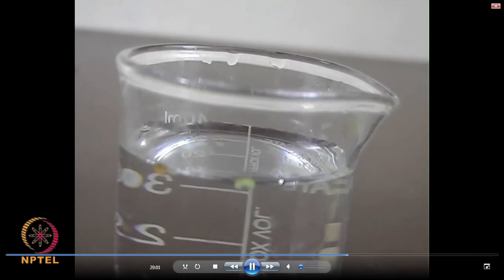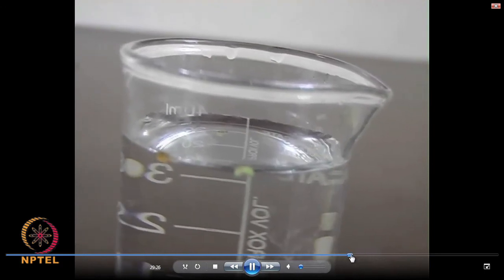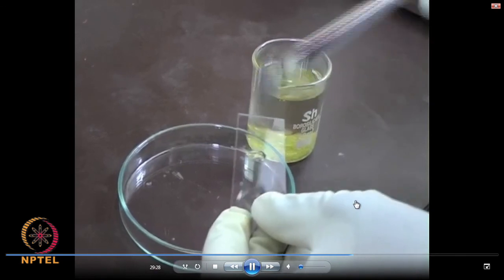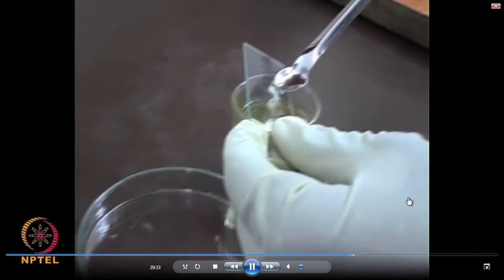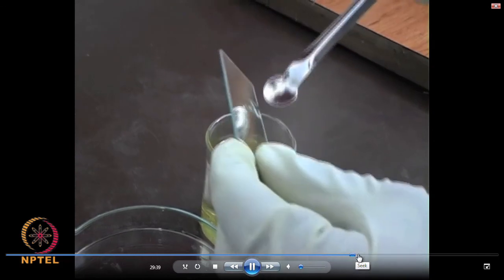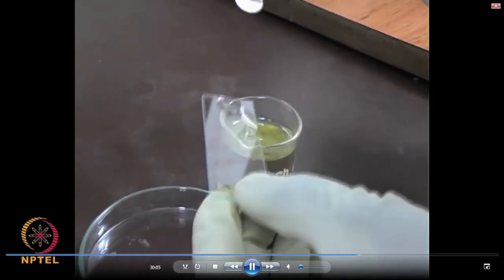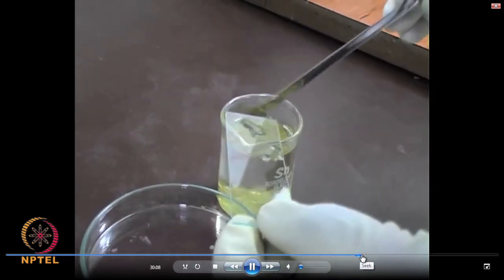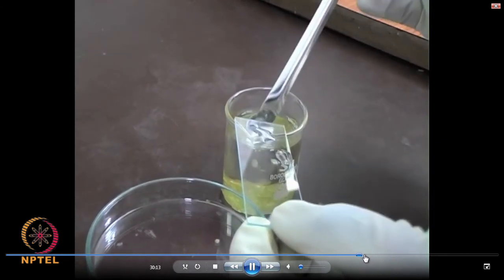So, you take up one of these slices and put it on a glass slide. First you place some water drops in order to hold that slice intact, and this is how it is done. You can put 2-3 places of water like this, and then keep one of the cross sections taken from the plant stem, and now we will see how it appears on the glass slide.